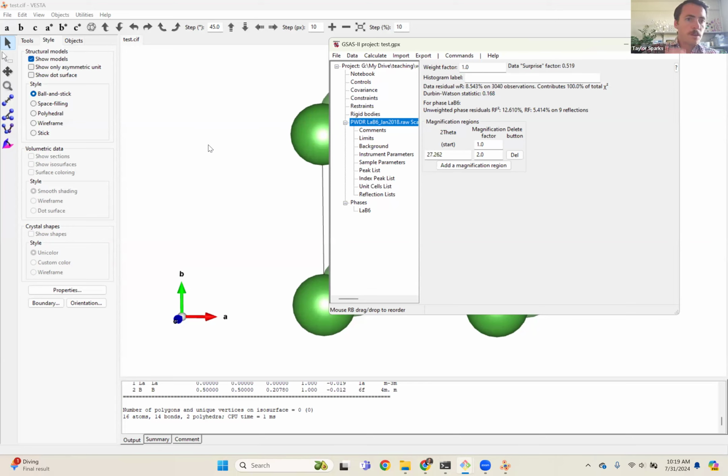Somebody says, the tips when we integrate these data refinement views, toggle switch views of the map, visual in 3D, are we switching software? Yeah, we're showing that right now how to do that. Once you have your refinement, all that information about the structure, how do you actually plot that in 3D? That's what we're going to do in Vesta. And then it says setups for switching views will be covered later. Yeah, we're going to talk about how to do that in a moment.